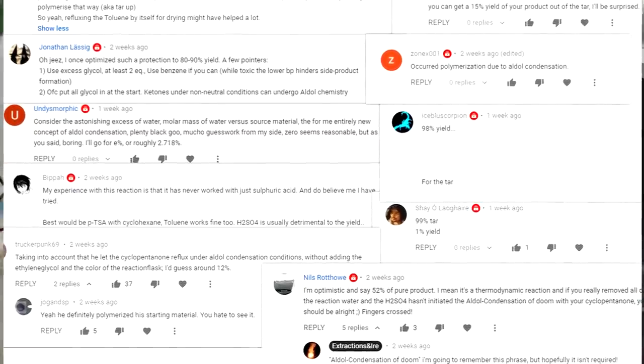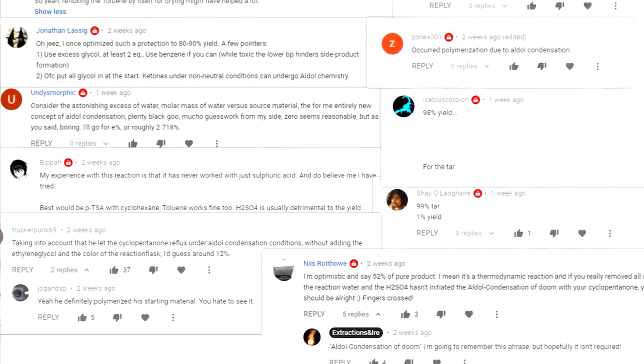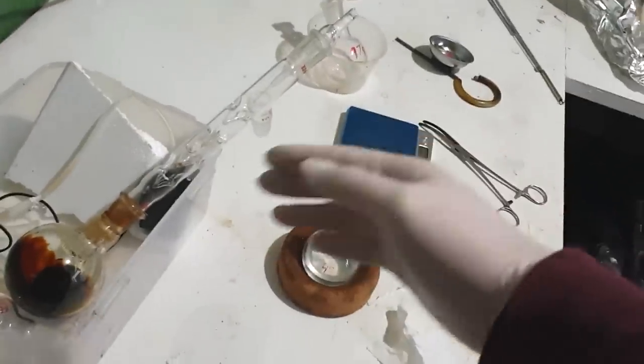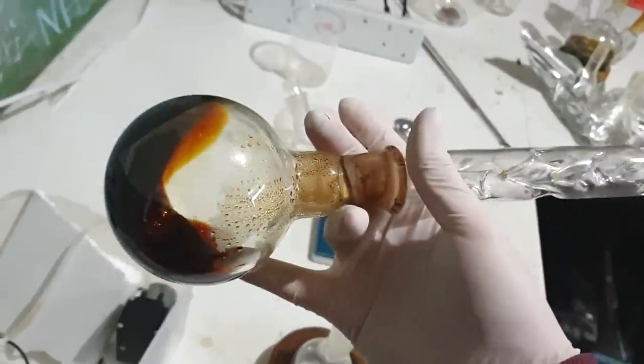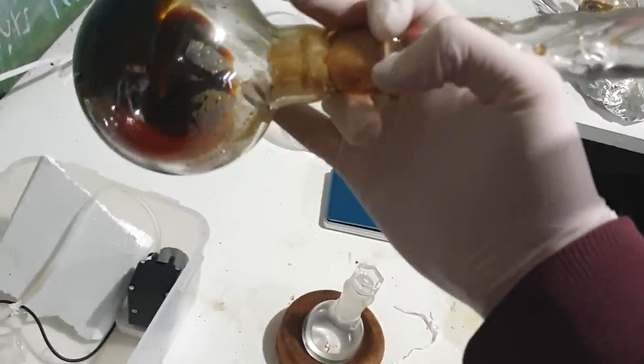The problem with that is that there's another side reaction, and that's an aldol condensation. Two different cyclopentanone molecules can react under acidic conditions. Those two can then react with a further ketone molecule, so it can keep going and going and going. What you get is this huge condensation reaction, and the result is tar. And a classic sign is this red tinge here. That's a classic sort of aldol condensation sign. It's not a yellow, it's a red.